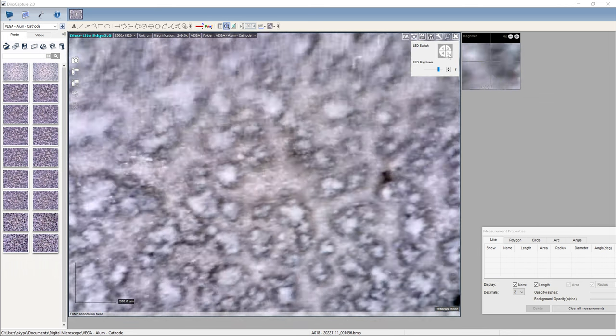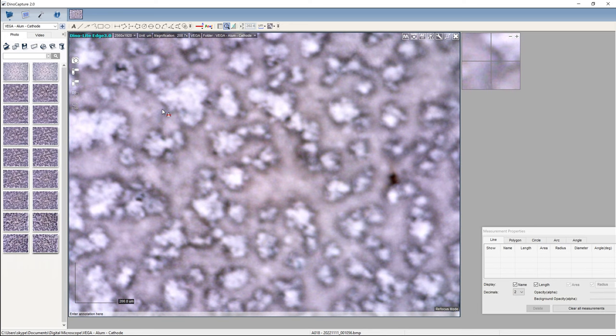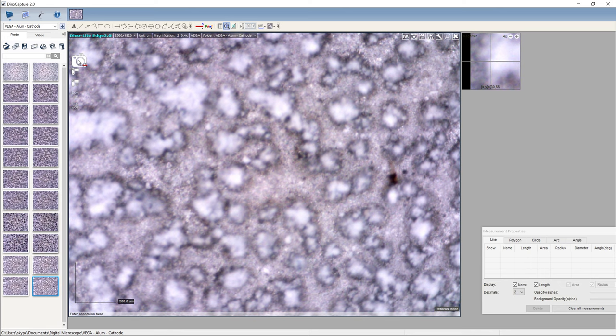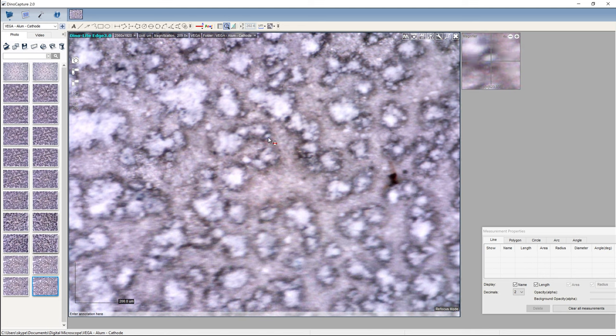Going to play with the polarization. So this is with the polarization fully on. Gives a little bit more separation color wise. So yeah, I really would wonder what this thing is here, because it seems smooth-ish. It's not like the aluminium down here, and it's not whatever these fluffy clouds are. These trees. So what is it? To be determined.